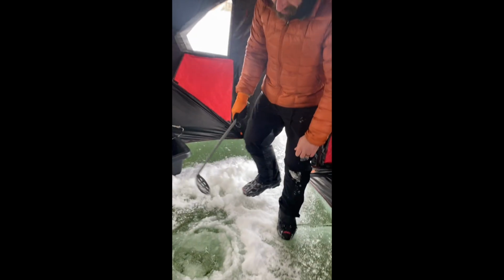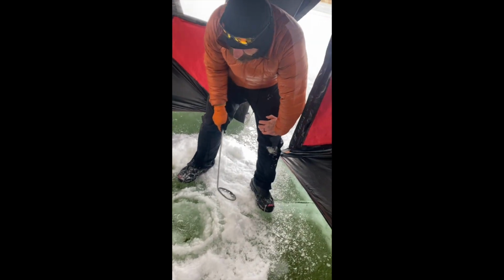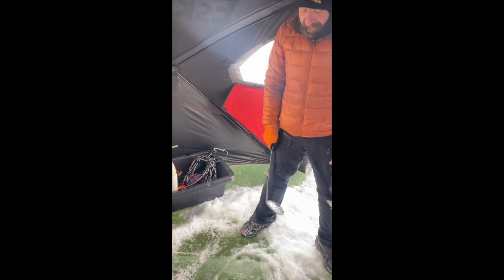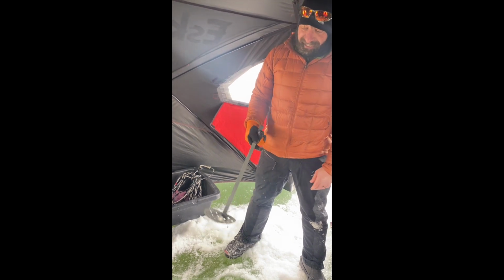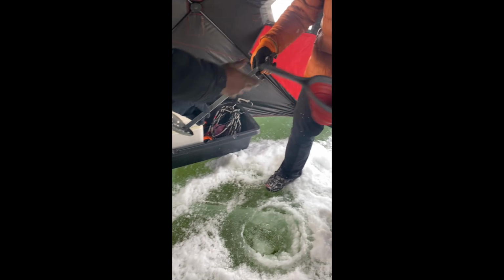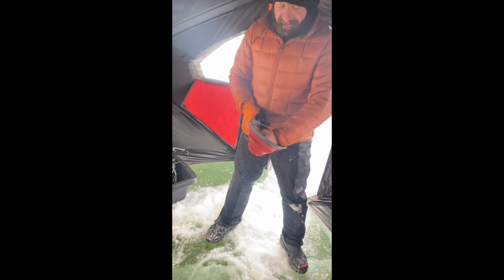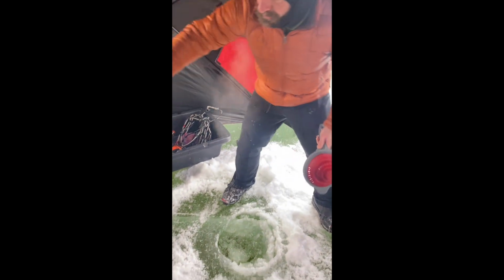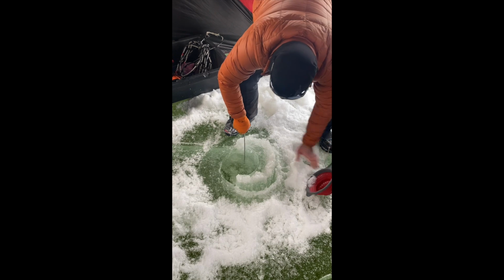It helps to clear the slush from the hole, especially when you're doing zooplankton tows, because otherwise the slush is going to clog up your net. You've probably all seen slushers like this. They're kind of useless. What we prefer to do is just a collapsible pasta strainer. They don't take up a lot of space and they work much better. I'm just going to use this to pull out this chunk of ice.